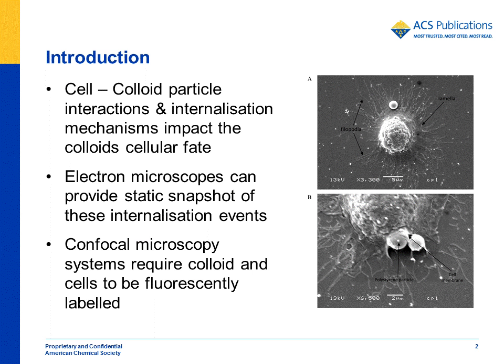Improved temporal resolution has been achieved using light microscopy techniques such as confocal laser scanning microscopy. However, this technique suffers from the drawbacks of poor spatial resolution compared to the electron techniques and the requirement for fluorescent labeling of the cell and the drug delivery system of interest. In some cases, a new labeling methodology may be required for each unique drug delivery system, which can be costly from both a resource and time perspective. The fluorescent label may also cause phototoxicity to the cell.